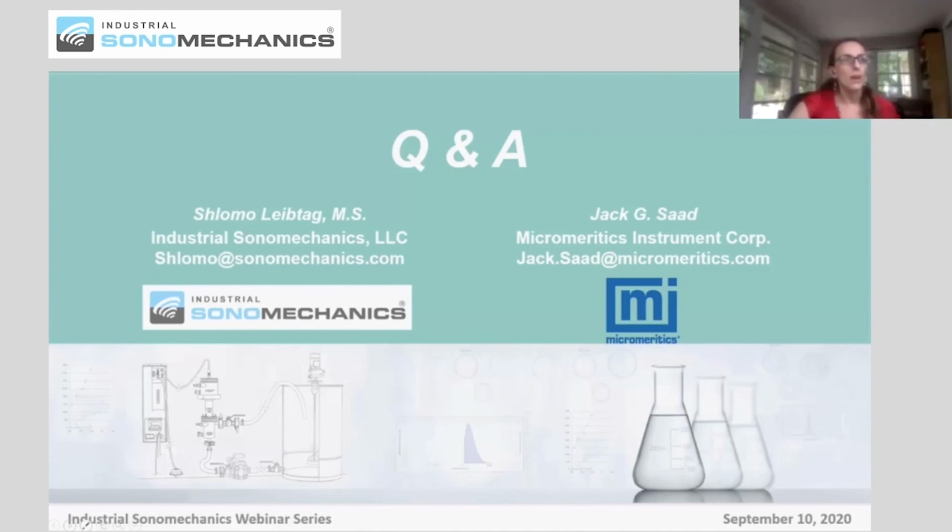Great. I also have another question for Jack. Does dilution factor have an impact on particle size? How can you be sure? And how can you find the best dilution factor to determine the size of droplets by dynamic light scattering?